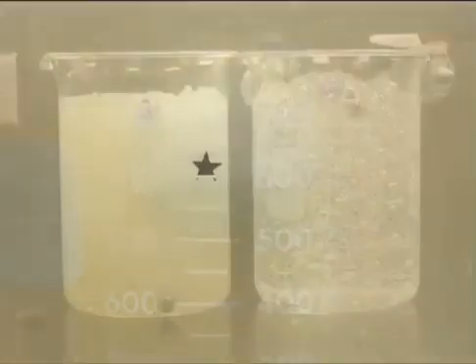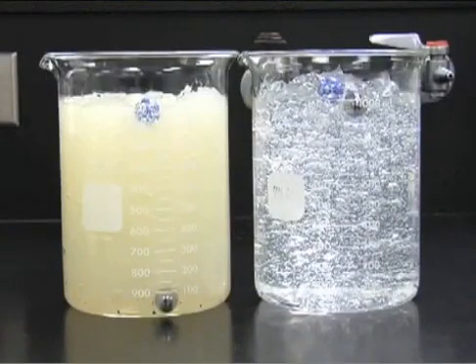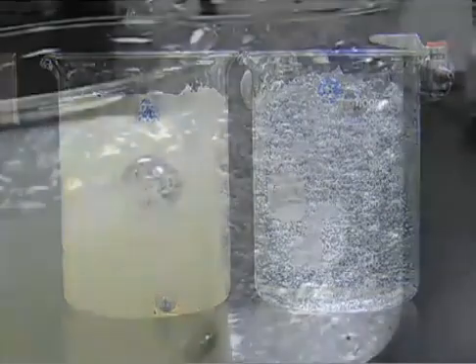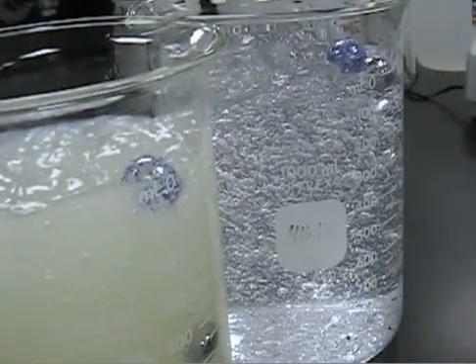In comparison, Carbopol's high efficiency and superior suspending ability are obvious. The Carbopol gel incorporates one-tenth of the polymer level of the xanthan gum gel and still suspends all of the spheres of varying density.